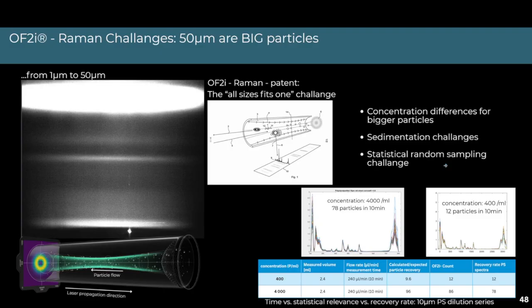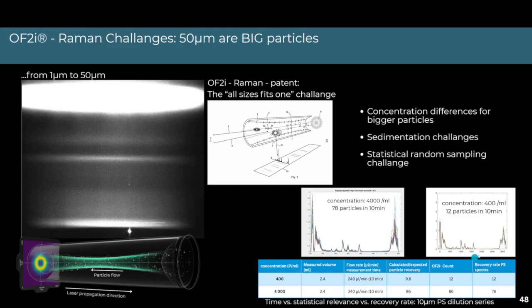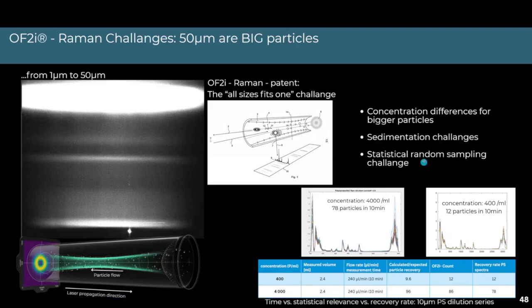And to clearly prove with certified reference methods and materials that we are able to do what we can do. So this is what we work on right now. One of the big challenges is to have certified reference materials available, so that we can say our physical models give this and our experimental values prove that physics basically works, and it works for each and every population, for each and every concentration range, and we can prove this with real statistical samples.